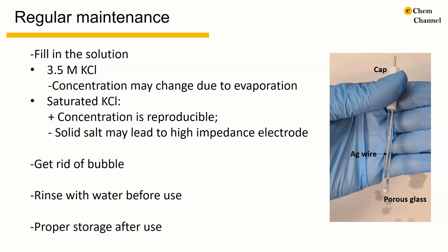Here is a picture of a CHI silver silver chloride reference electrode. There is a cap, a porous glass tip, a silver wire in the middle, and the glass is filled with potassium chloride electrolyte.